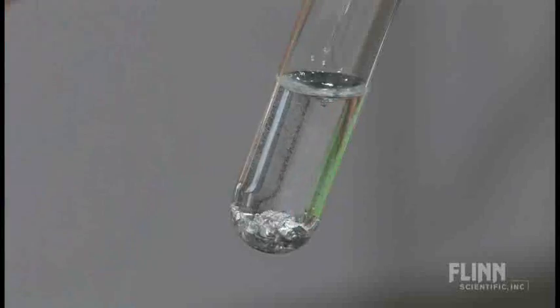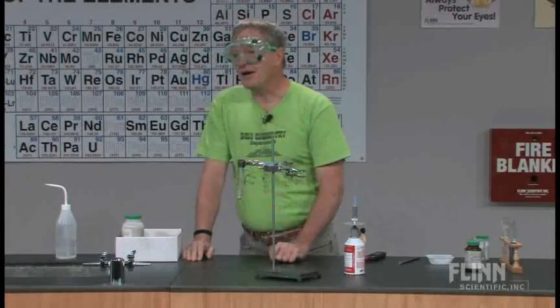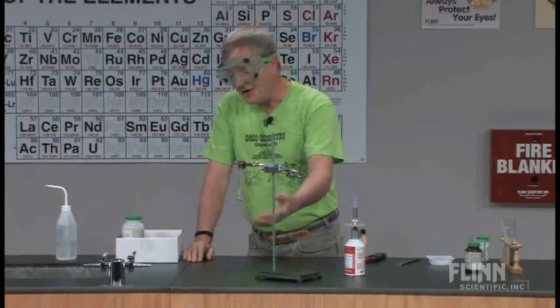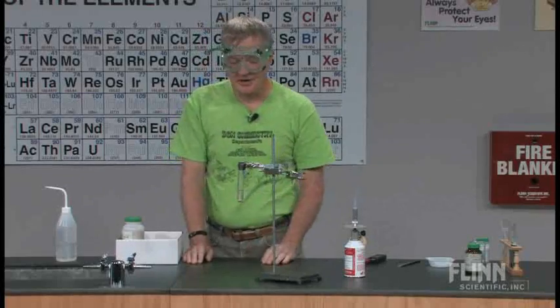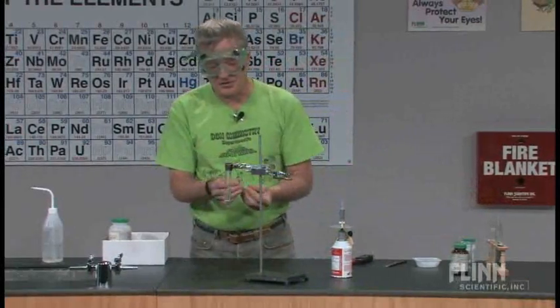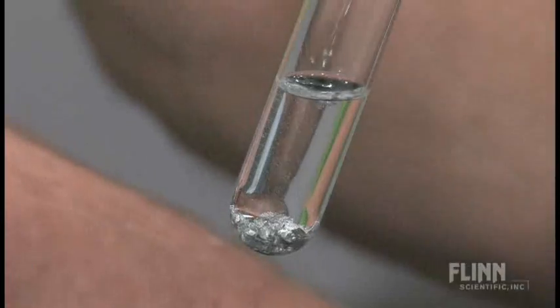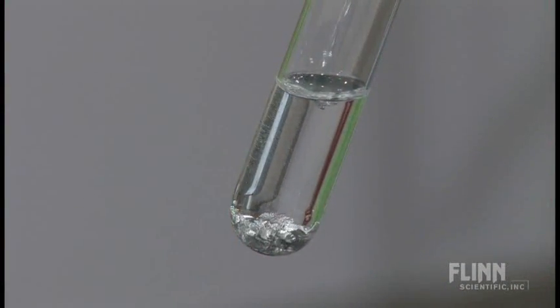When magnesium reacts with water, hydroxide ion is one of the products, along with the hydrogen gas. And if hydroxide ion is being generated in there, then I ought to be able to see that if I put an acid-base indicator in there. And I should see that I have a basic solution here. So I'm just going to drop in a little bit of phenolphthalein. And if I've let this thing react long enough, let me turn the Bunsen burner off here first. If I've let this thing react long enough, I should get some pink color. So let's hope that we get it.